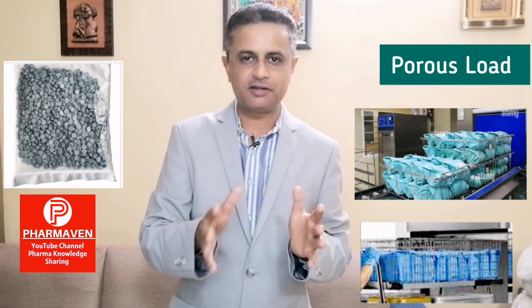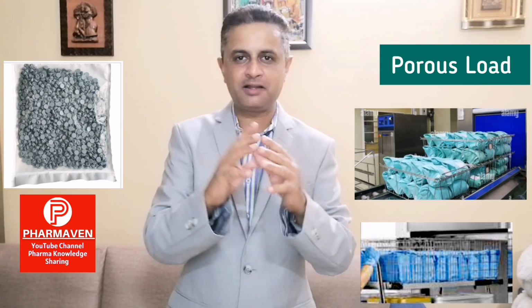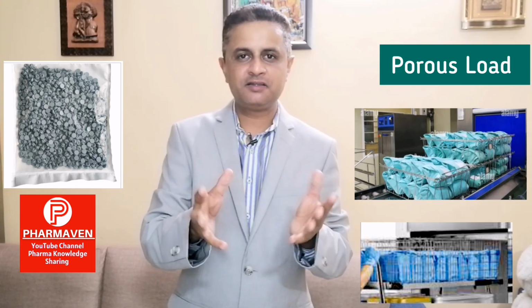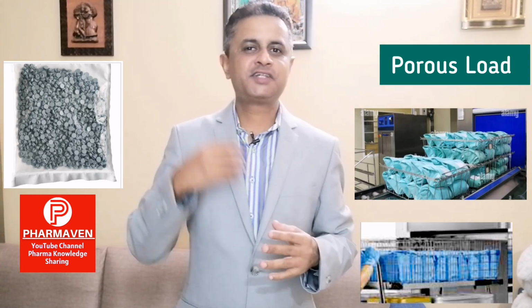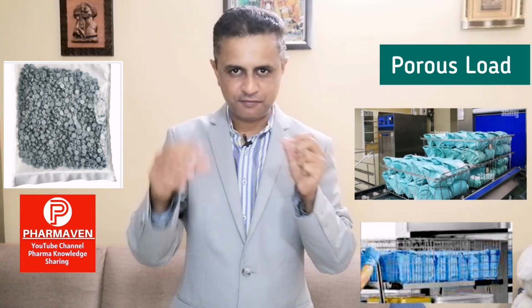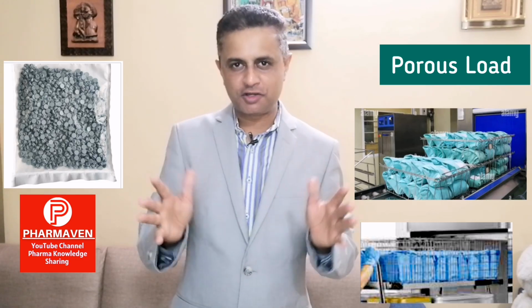It's not a solid load, it's not a solid block, it's not a metal item. It is something soft, something bulky which has many spaces within the load, which create pores, which have a lot of air entrapped inside, and that's how we call it porous load.